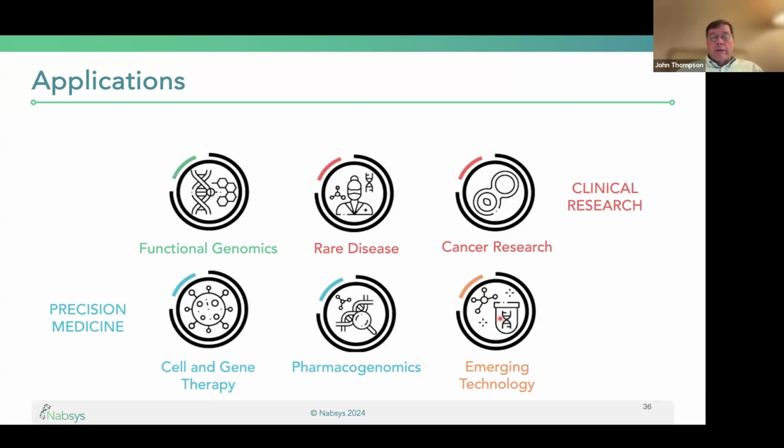And then emerging technology, the sky's the limit. I mean, there are lots of things that can be envisioned that could be done here. All the data I showed you only looked at a single size tag. Different size tags with different sizes or shapes will give you different patterns electronically. So we are exploring that as well for the future.